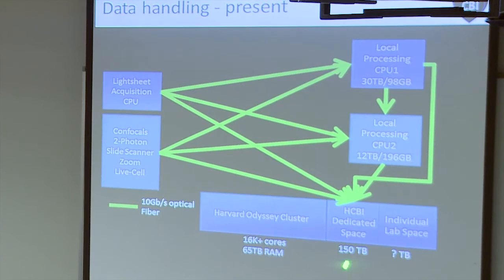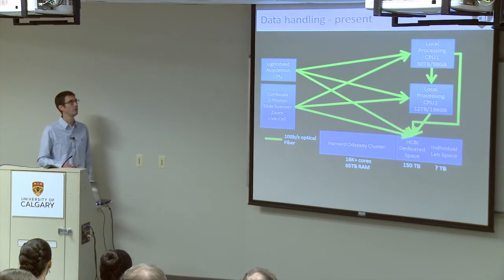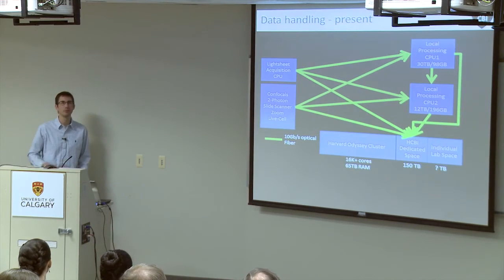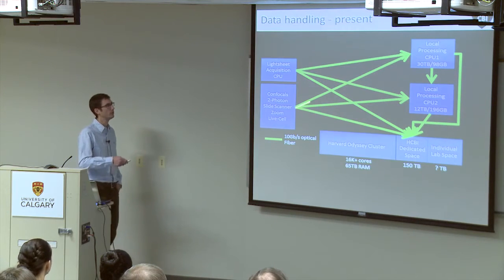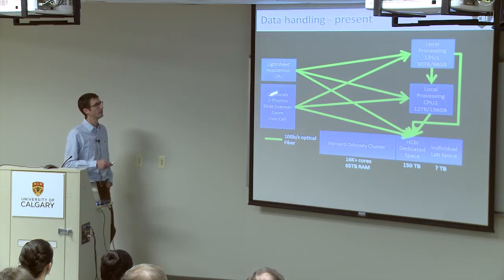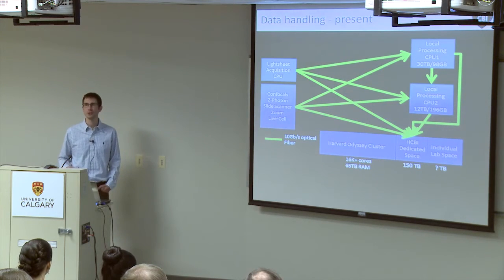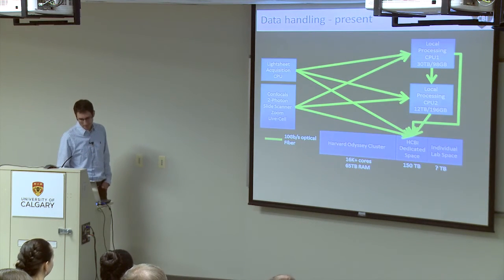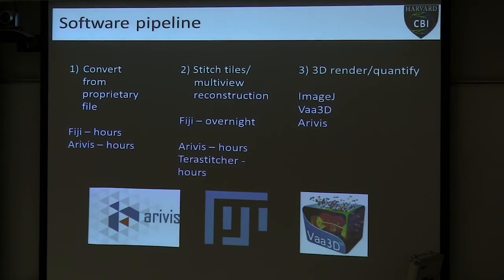The other thing is this idea of expandable storage space. It's actually pretty cheap right now. So like what I said, $8,000 for 50 terabytes. Although we do that at our server farm, that's something you can do in a closet in a lab. It's definitely possible. So you don't need some sort of crazy network where you're sending stuff downtown. But the key components are that you have that really fast transfer rate in between all of your different systems, and then you have some expandable storage. Because no matter how much you think is enough, it's not going to be.